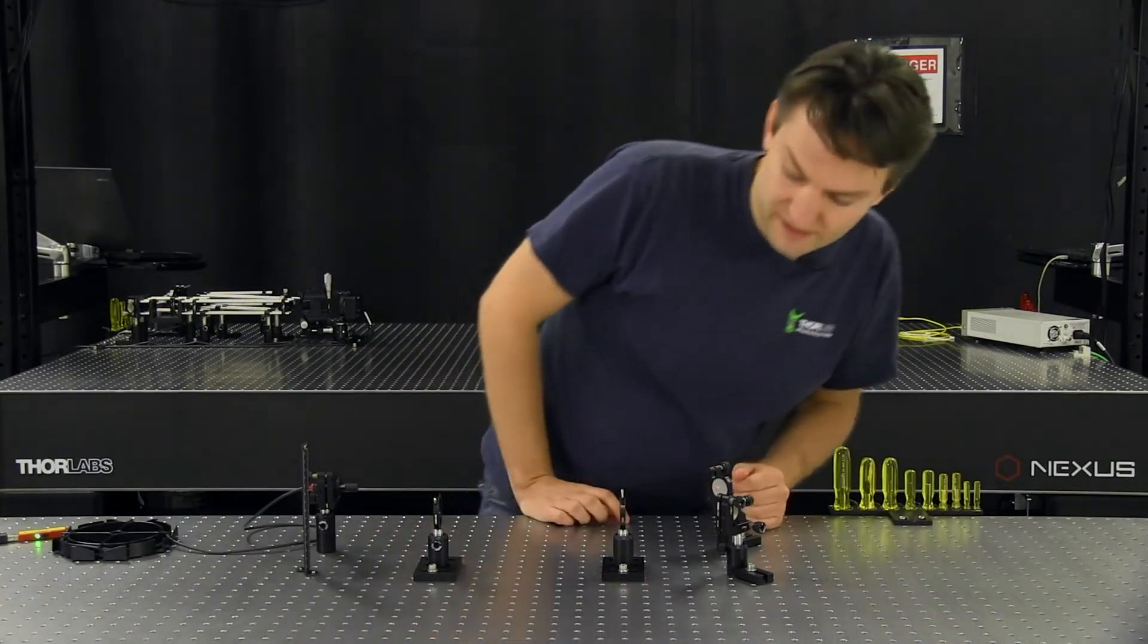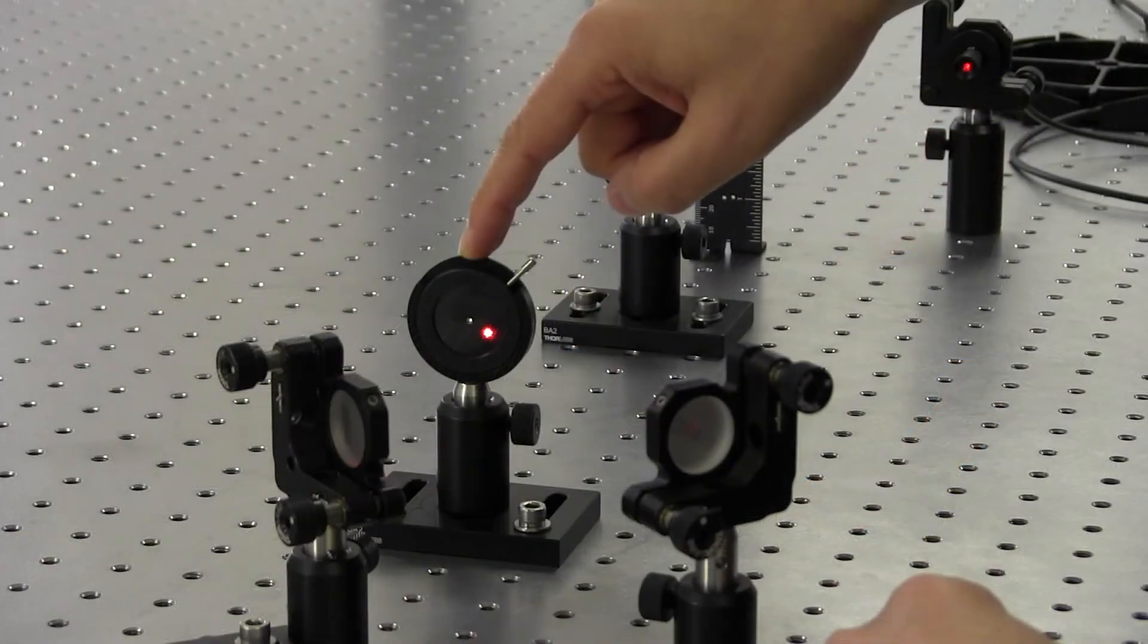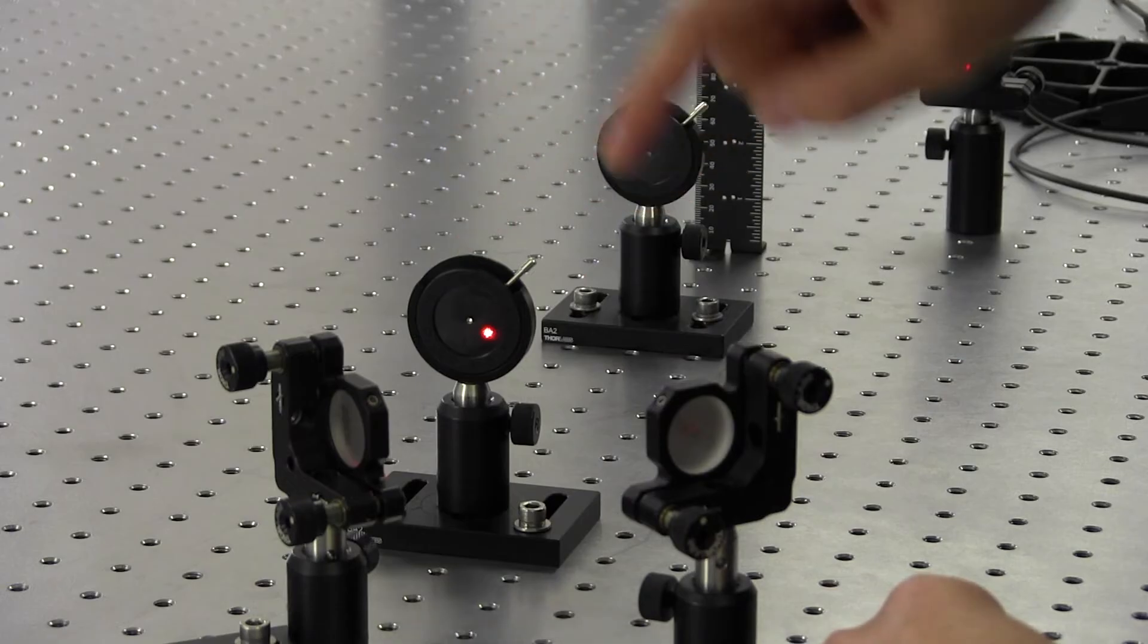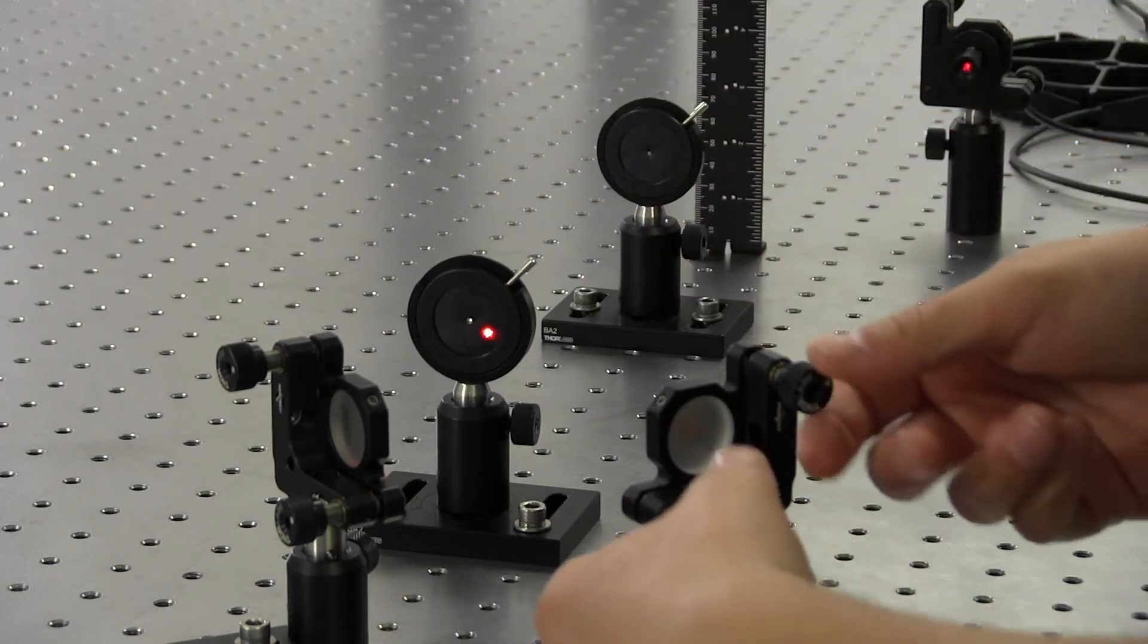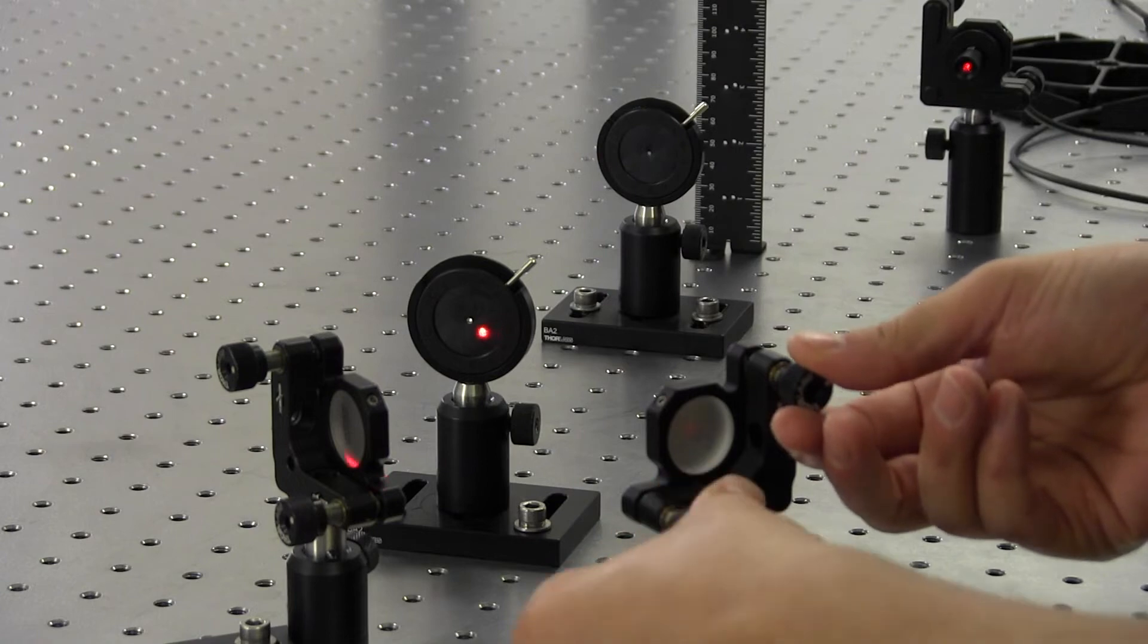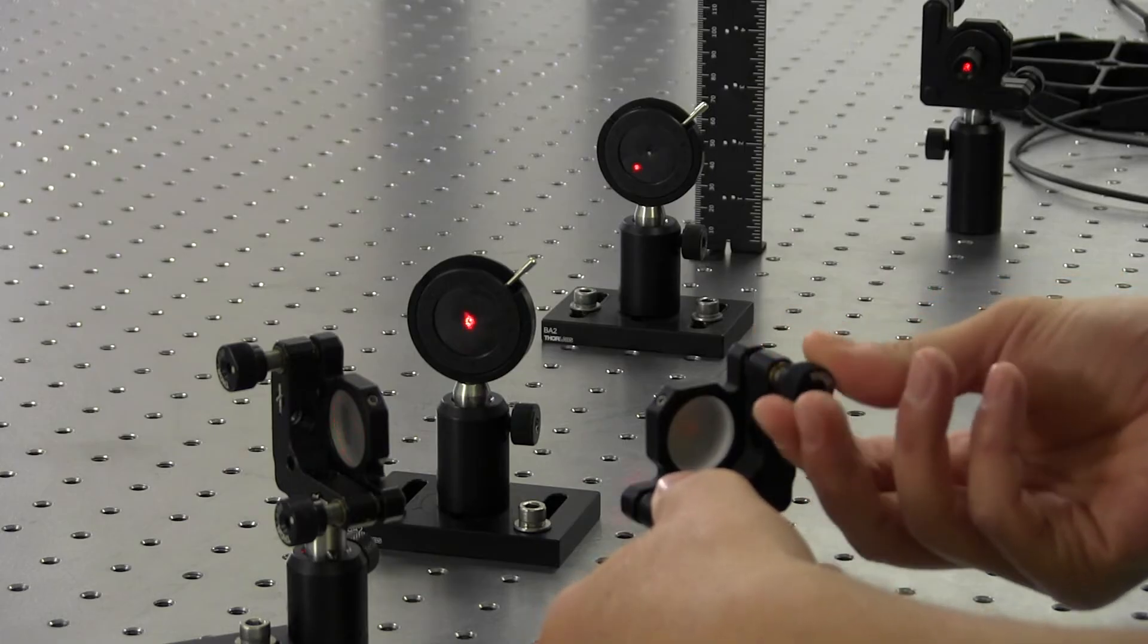So here, I can see, looking at the front face of the iris, I can see that I'm hitting down and to the right. And so I'll use this first mirror mount to move the beam to try to center it on the aperture. And I know I'll be centered when there is a nice halo around the aperture.